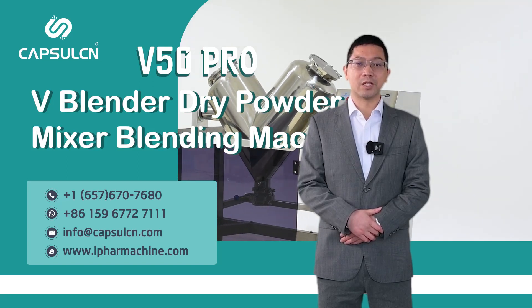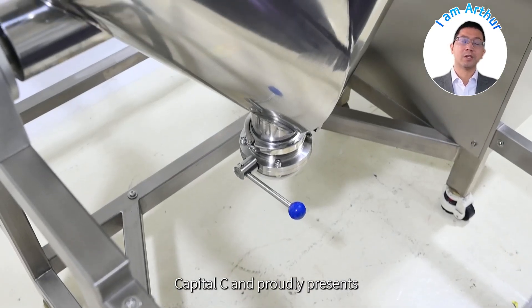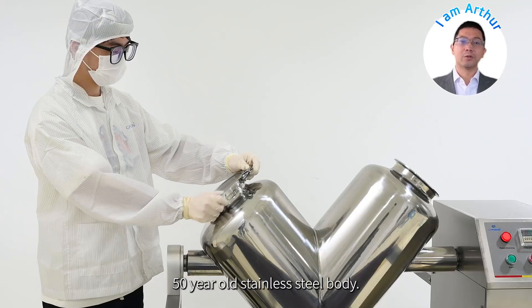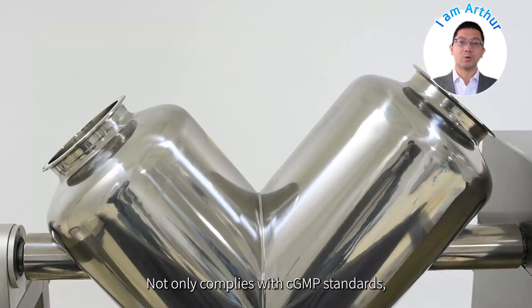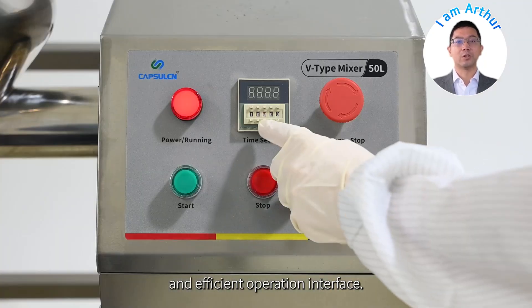Exploring a new realm of mixing in chemical, food and other industries, Kapusulcian proudly presents the V50 mixer. This 50L stainless steel body not only complies with CGMP standards, but also has a simple design and efficient operation interface.